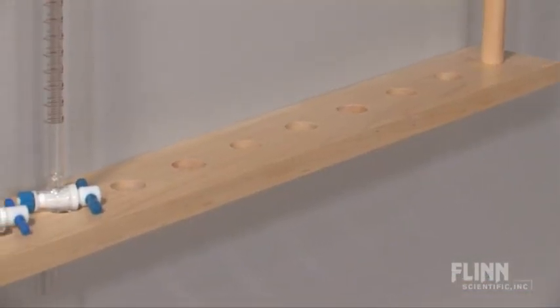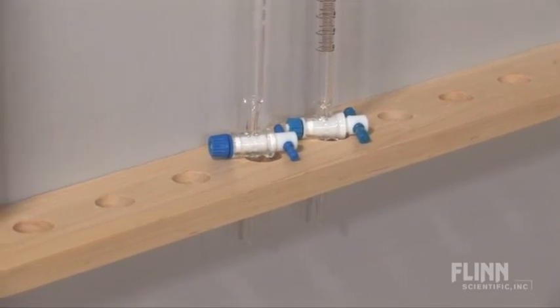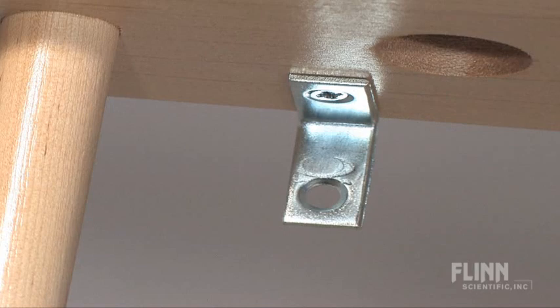The natural wood Flynn burette rack holds 12 burettes up to three-quarters inch in diameter. The rack is 32 inches long, 23 and a half inches high, and mounts directly to your laboratory wall using the included hardware. Burettes are expensive, and let's face it, they have an odd shape. Protect them with the safe and secure Flynn burette rack.